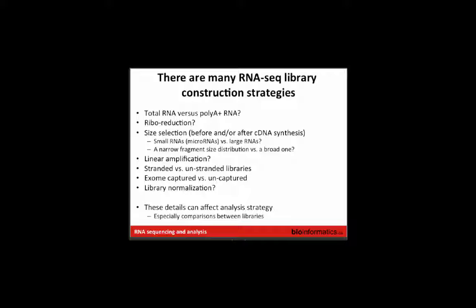So some people will select a rather tight size range for their RNA-seq libraries. They'll say, okay, it has to be between 300 and 400 bases, and I'm just going to cut everything else away that's either too big or too small. For people doing things like tumor sequencing, sometimes you have so little material that you're doing some kind of amplification. So one strategy is a linear amplification.